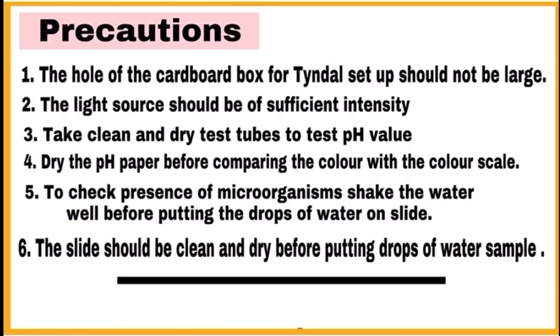Now precautions to be taken. First, the hole of the cardboard box for Tyndall setup should not be large. Second, the light source should be of sufficient intensity. Third, take clean and dry test tubes to test pH value. 4. Dry the pH paper before comparing the color with color scale.